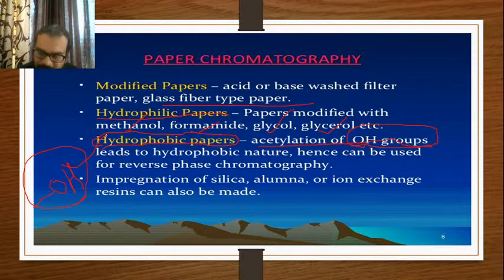We cannot limit ourselves to the Whatman filter paper also. Because of its physical parameters, a variety of Whatman filter paper in different grades is available with us.